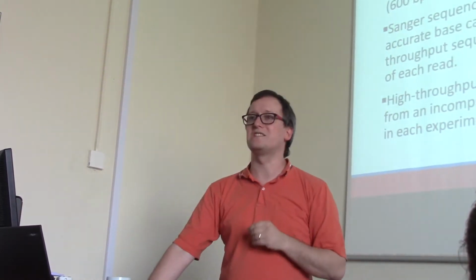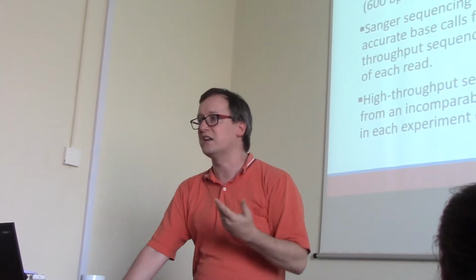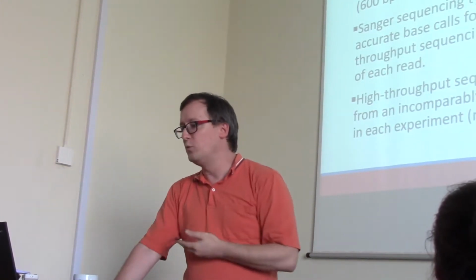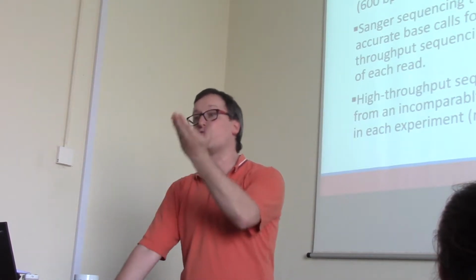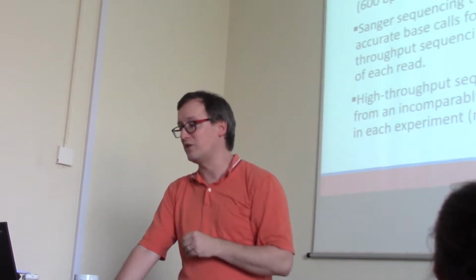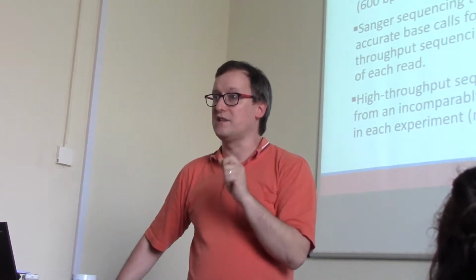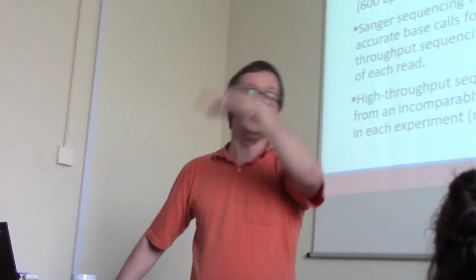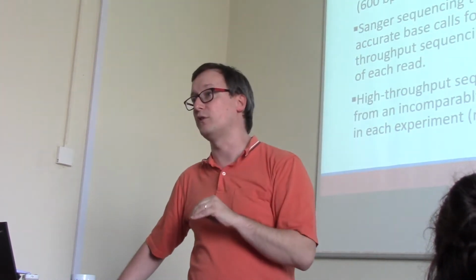In this case, I'm using Sanger as a synonym for old school, I guess, in sequencers. So we tend to think of Sanger sequences as producing higher quality scores for individual base calls. That said, it's definitely the case that modern sequencers that produce huge numbers of reads frequently cover the same region many times over.